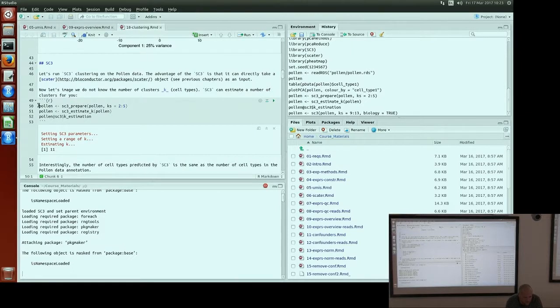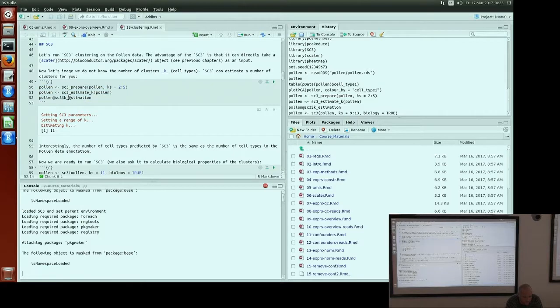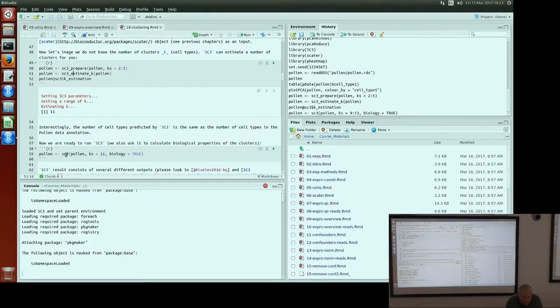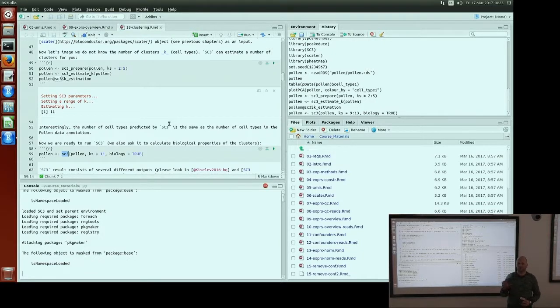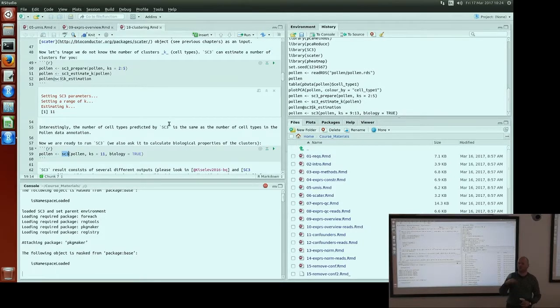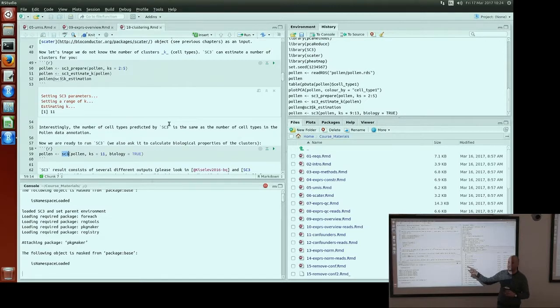Then we run SC3. To estimate k at the beginning, there are some preprocessing steps. Then to run SC3, you just use the SC3 function. It uses the expression slot. By default when you create a SCATER object, if you provide counts, it will create log2 CPM of your counts as the expression slot. When you do normalization and batch correction, most functions write the output to the same expression slot. SC3 works with the expression slot, but there is a parameter in the function where you can define another slot if you want.